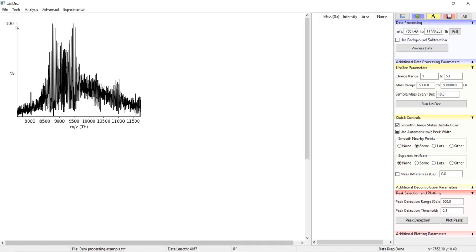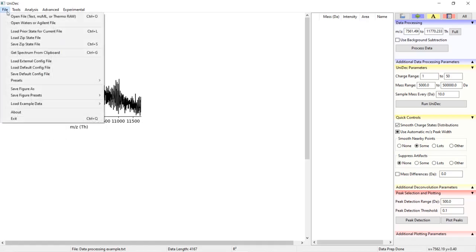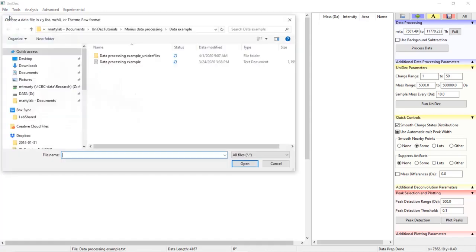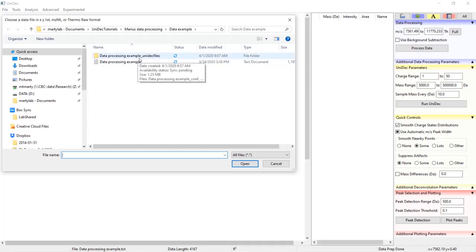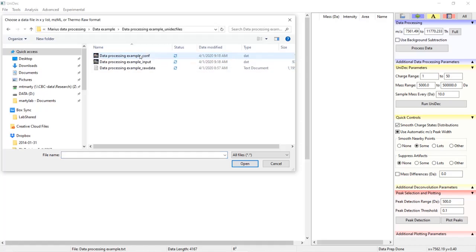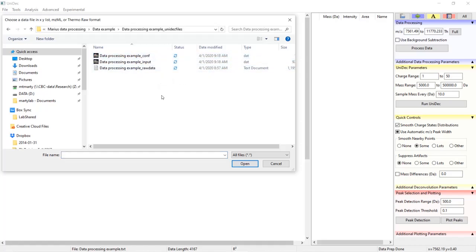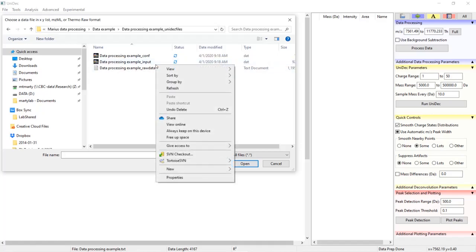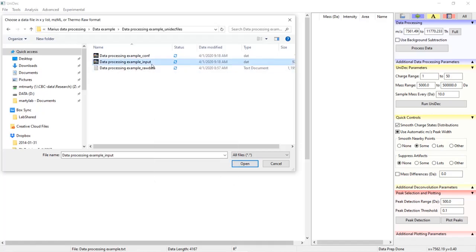If we open the folder where this data originally came from, you'll see another folder with the same file name just with an underscore UniDec files.